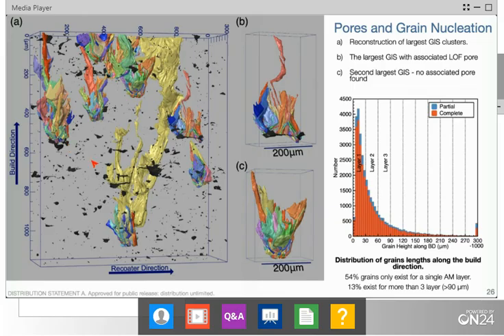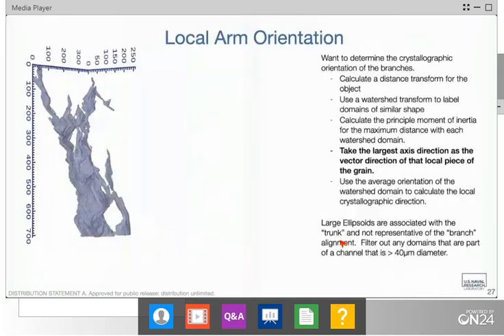So we found that to be a very interesting result, and it was kind of a fun thing to see how these grains cluster and the pores cluster, but we think that most likely this is due to some poor alignments of the AM structure, or some poor raking of the powder during that part. And we're not sure if that's associated with the gas flow or if that's associated with the lineup of the raster direction with the other features, but that's what we saw.